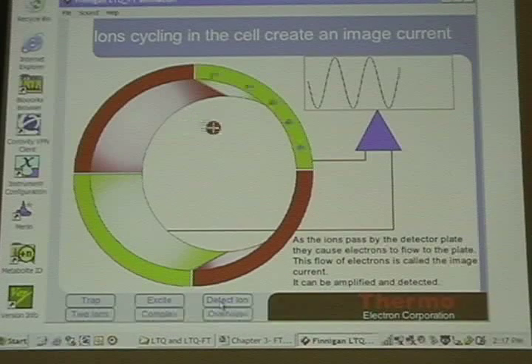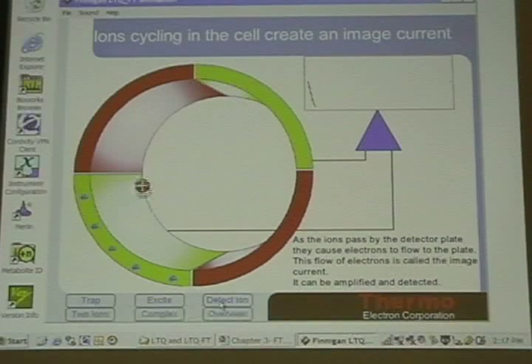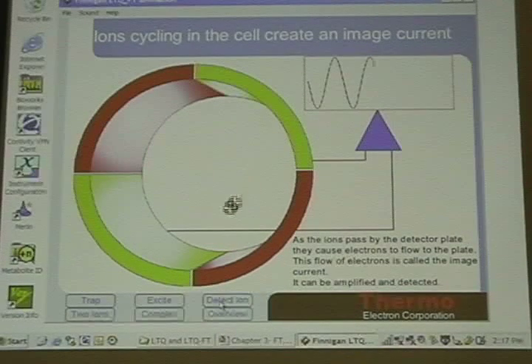I don't think there's any scientific reason. It's more historical. Because we've run profile and centroid, we don't find more phosphorylation sites with either one. So we probably run centroid, right? Why waste the hard drive? Yeah, I agree totally. Most people will disagree with you, saying if it's an FT, it's got to be profile mode data.